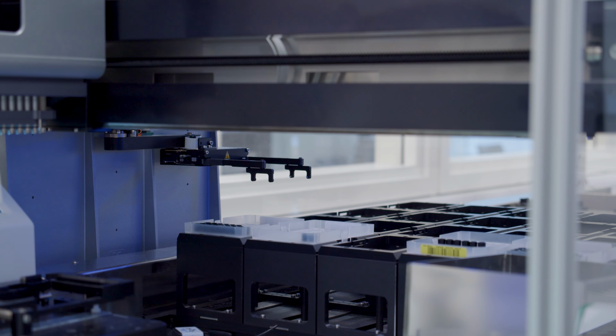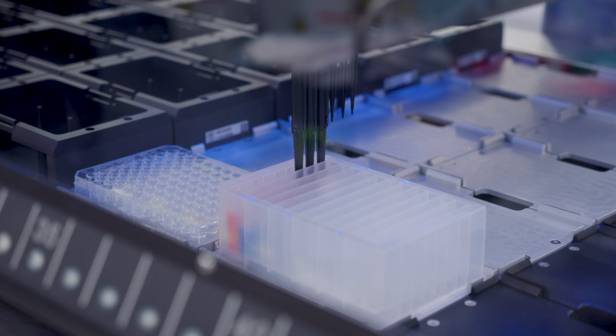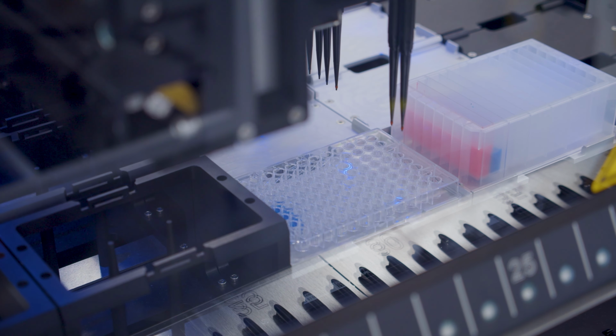The Hamilton will kick into action and pick up tips, aspirate your input liquid, and dispense it onto your output plate. The channels can behave independently, so they can dispense at the same time or separately.